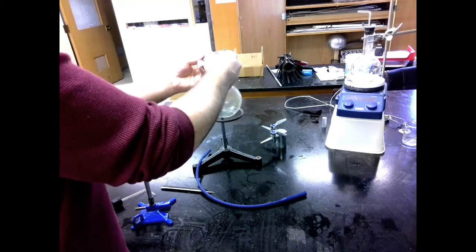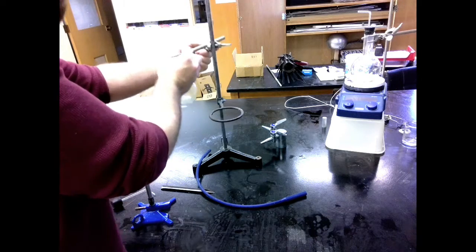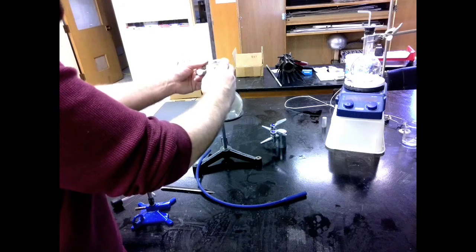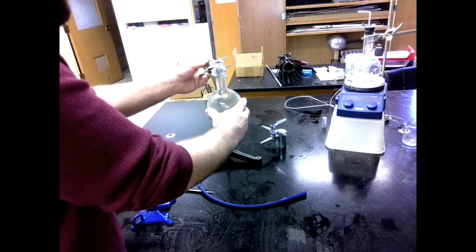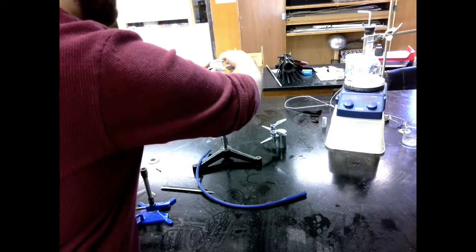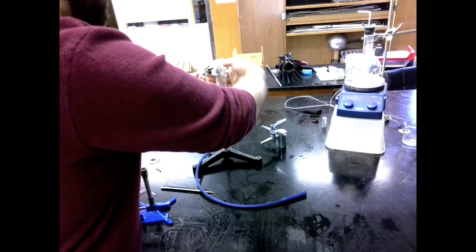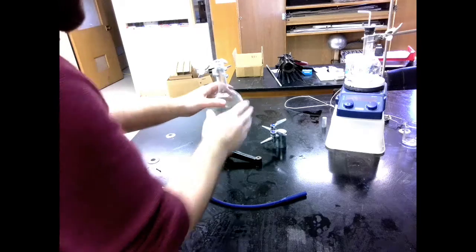Now I need to loosen this. This can move freely, and this clamp here can move freely so that I can place this nice and gently right in that ring, and then clamp both parts. Clamp it to my ring stand, clamp it to my holder. And now this is nice and sturdy.